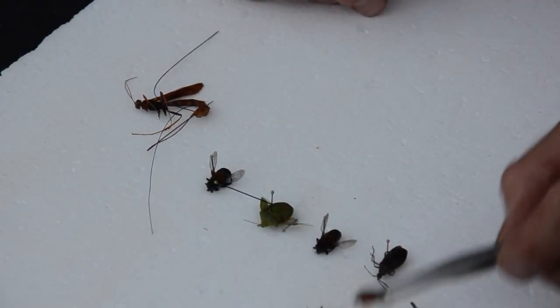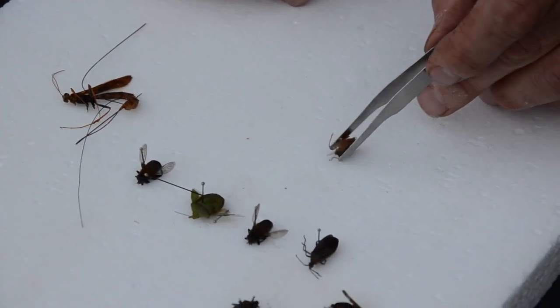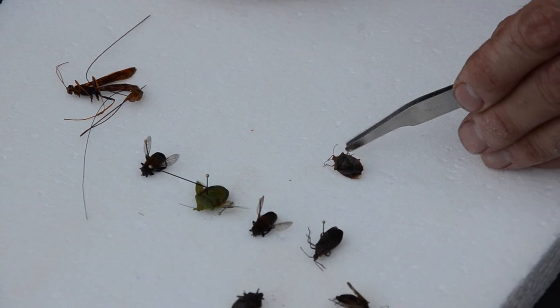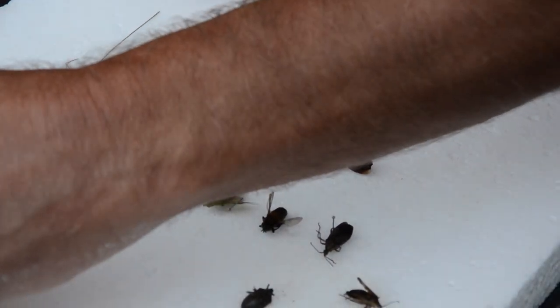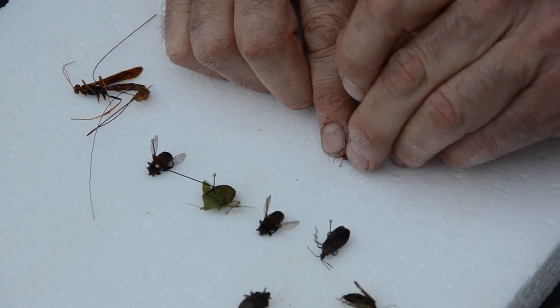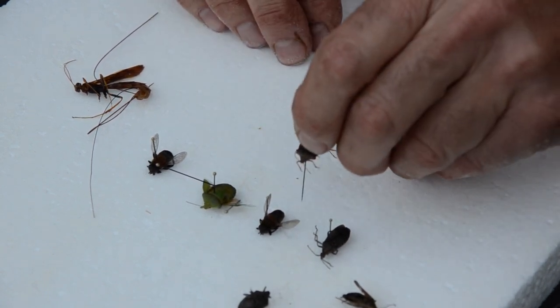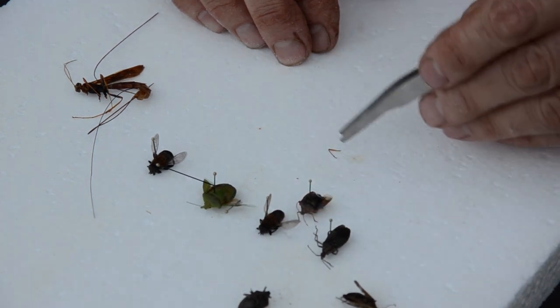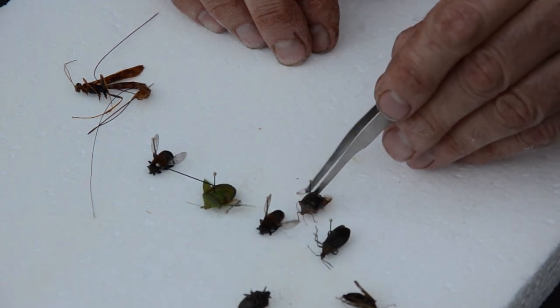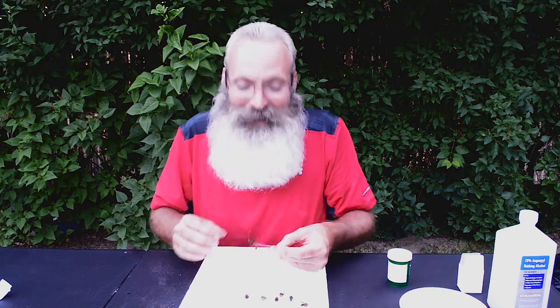I'm going to grab one more of these and do this, and then we're going to do our ichneumonid. Again, head, thorax, abdomen — I'm looking just a little off to the side to put that pin. I'm using a number two insect pin. This is a hemipteran because of the half wing. A leg came off on this one — these are brittle little buggers.